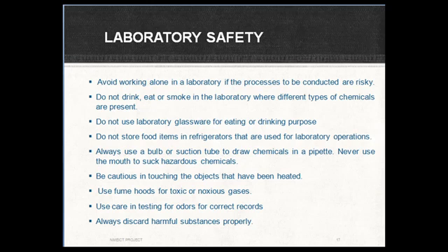Be careful in touching the objects that have been heated. Always fire polish the ends of the newly cut glass. Use fume hoods for toxic or noxious gases. Use care in testing for odors for correct records. Always discard harmful substance properly.